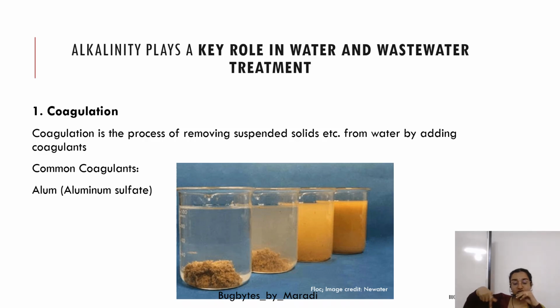When you add the coagulants to the water which contains these suspended solids, they cause clumping. When they clump together, we call them flocks. It will be easy for us to remove these flocks.